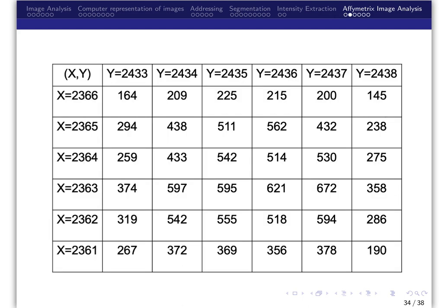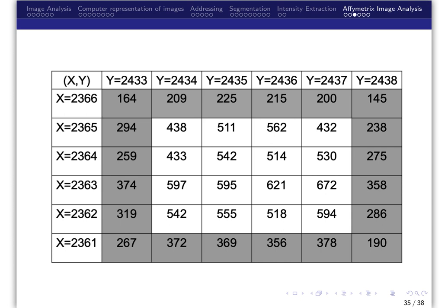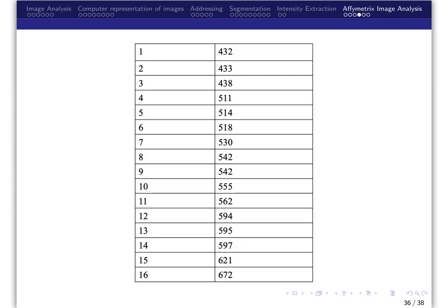Let's look at an example. These are actual pixel level intensities from a gene chip for a specific probe. Within the probe, there is a 6x6 grid of pixels for which we have the intensity values. Note the intensities around the perimeter are lower. Eliminating the perimeter pixels or outer edge, we are left with a 4x4 matrix of foreground pixel intensities. The 75th percentile of the interior pixels is taken to be the probe level expression value, which is 594.